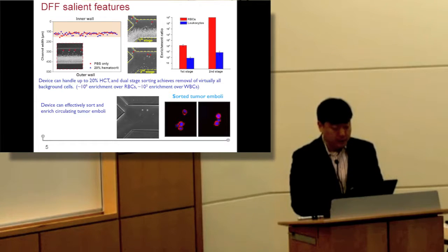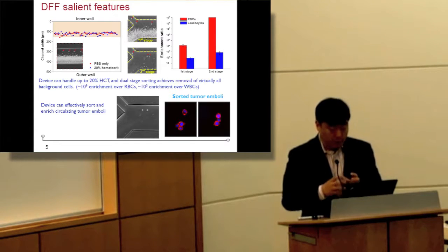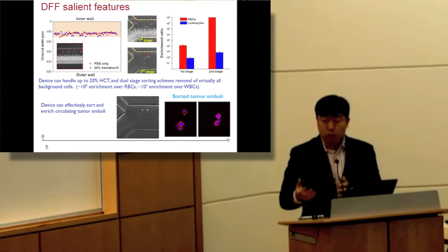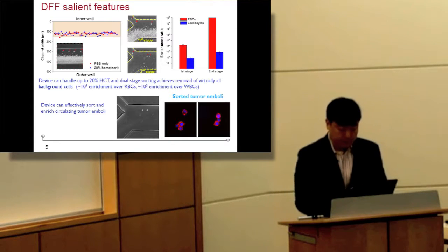And if you run this device twice or a third time, we can enrich the very low abundance cells like CTCs while rejecting all these other background cells. For example, we are achieving almost 9 orders of magnitude rejection ratio for the RBCs. That's practically removing almost all of the RBCs from the given input blood sample.